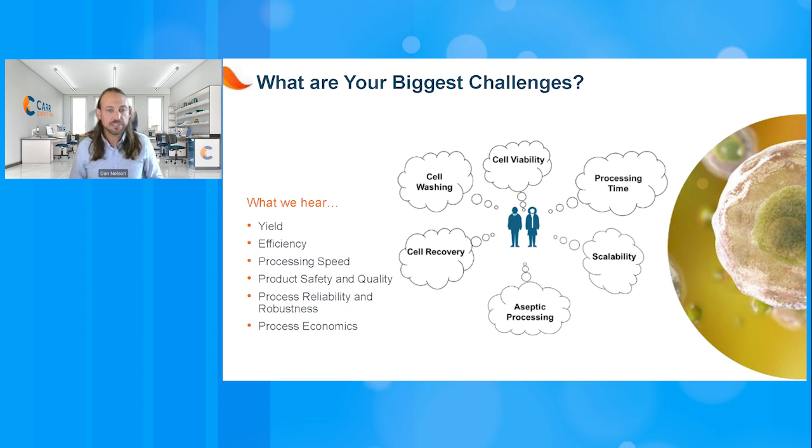Another is efficiency: I want to reduce my downstream burden or impurities. Or I'm spending a lot of time preparing, operating, and disposing of these consumables and the buffers that are involved. Or I've got a lot of products and a lot of different processing needs or separation steps, so I'm looking for a more versatile or robust way of handling all of my platform needs.